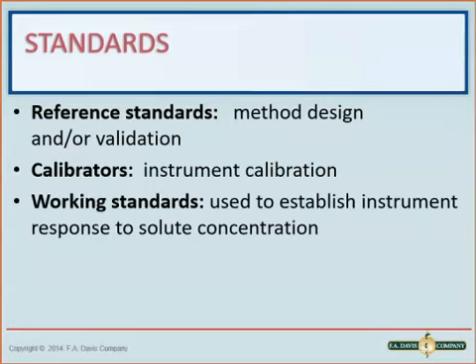Next up on this slide, we have some more terms that we need to be aware of for the laboratory. We have things called reference standards. These are usually solutions that are used to help validate or test the method and design of our instruments or our testing methods.